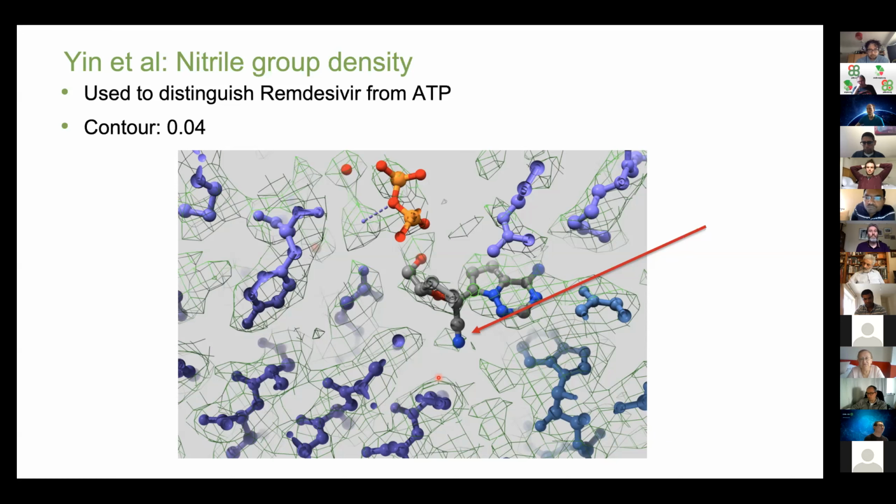It means that if you have some kind of distortions and elongation, what I suggested is why in certain cases, for example, nucleotides are very well resolved, and in other cases they are not, they are linked between each other. That's my impression, that it depends on the distribution of angles in the Euler sphere.